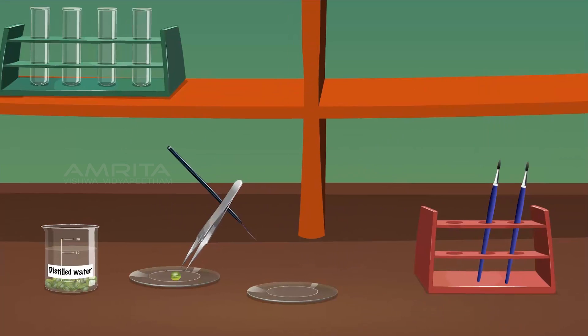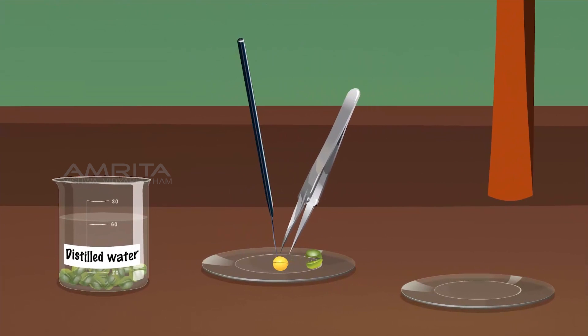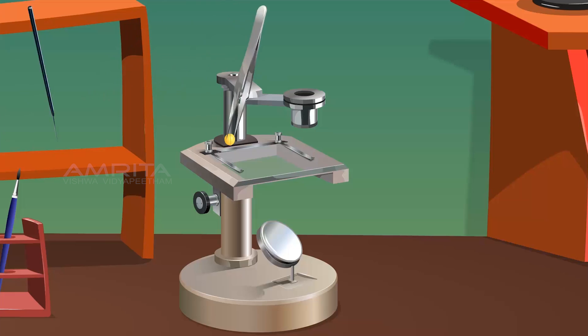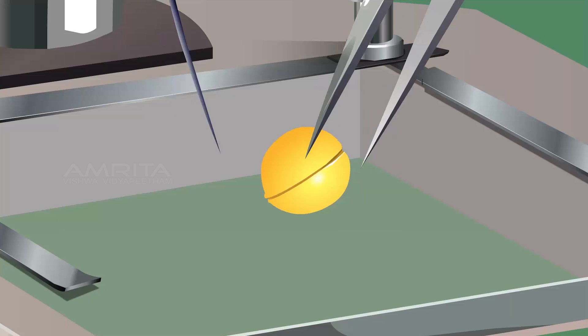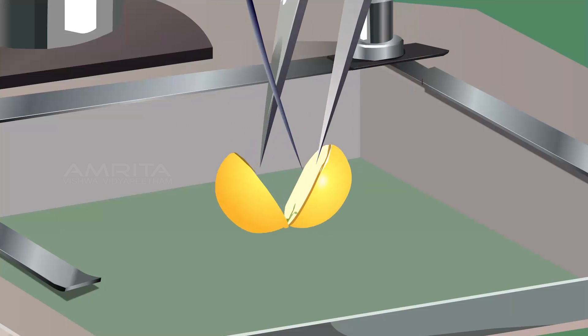Remove the seed coat of the pea seed using the forceps and needle. Using the forceps, pick up the seed and place it on the stage of the dissection microscope. Separate the two cotyledons of the pea seed using the forceps and needle. Observe the seed through the lens of the dissection microscope.